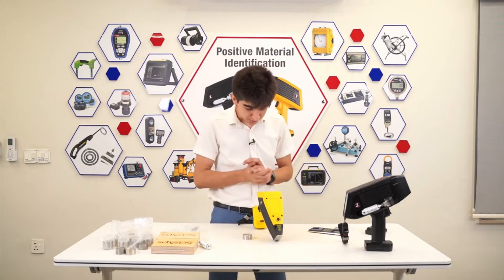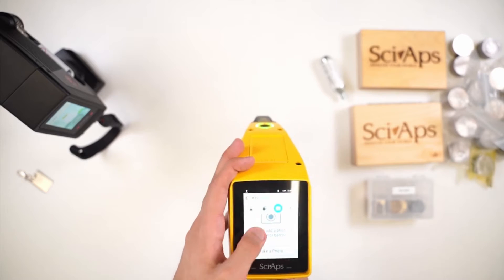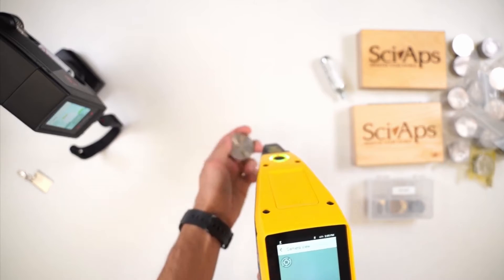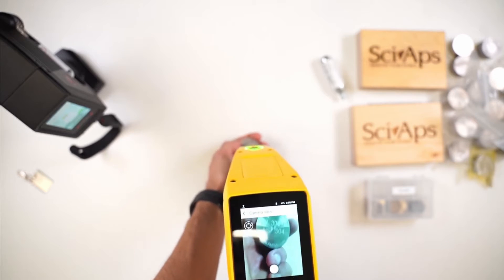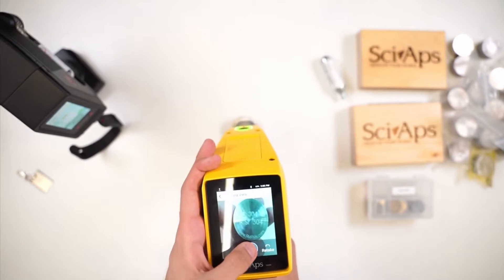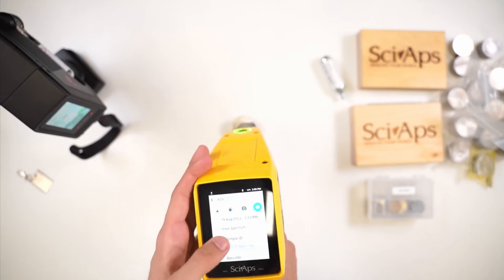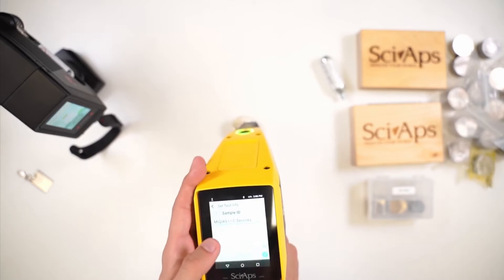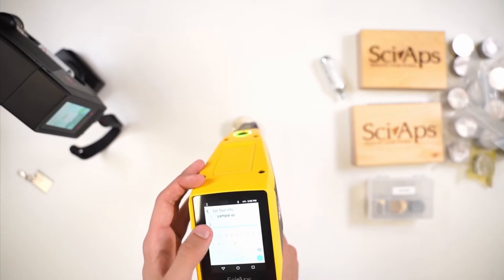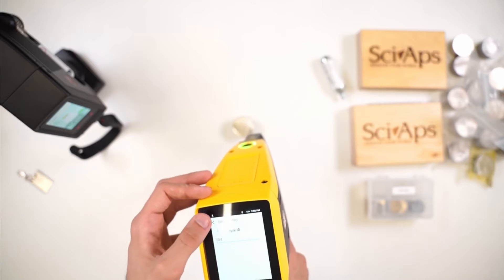A couple of cool things you can do here — take a picture. I'll take a picture of the block, press the trigger, and save that. Now I can name the sample. For example, let me go ahead and say 304. That's all.